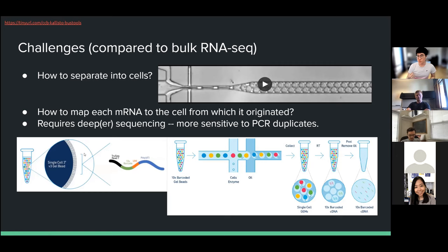and each of these beads has its unique cell barcode, a barcode sequence that is unique for each bead. You put these beads into each of these droplets along with the individual cell, and by doing so you can essentially capture all the mRNA from that particular cell on a single bead. The capture is done by this poly-dT priming because we know that mRNA is poly-A-tailed. So we solved that second problem. Using this cell barcode, we're able to rather confidently tell which cell the mRNA originated from.